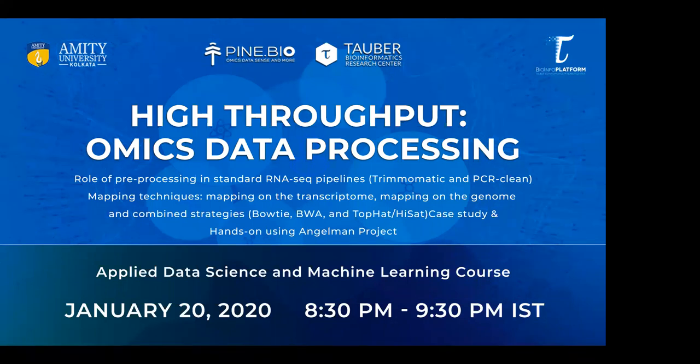So what we are trying to do here is process the raw data and make sense out of it by generating a table of expression. From raw data to a table of expression which has biological meaning, because raw data with a lot of artifacts and a lot of noise is not the data that you want to go with without processing. So pre-processing is very important, as well as mapping, and that too with the annotated genome. We'll be talking about all those in this class.